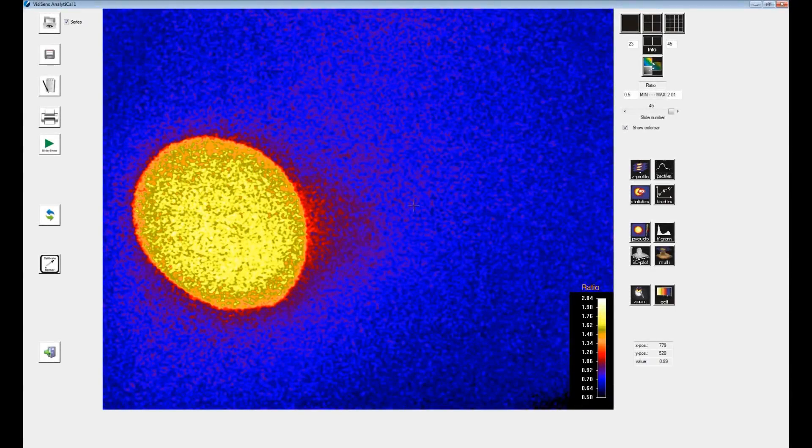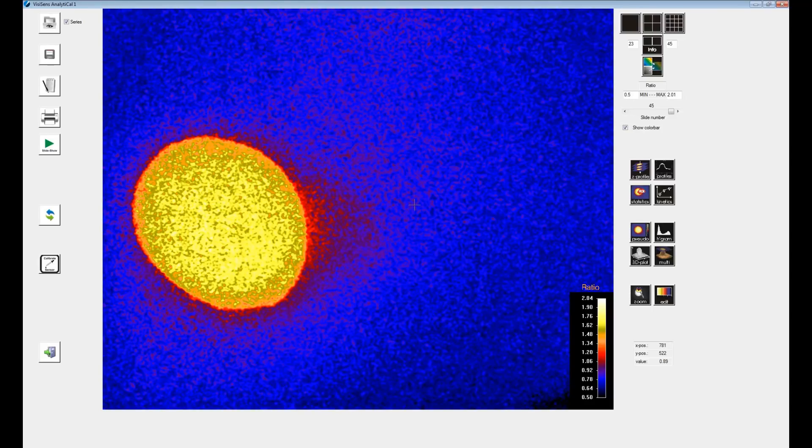Here is a short introduction on how to perform a calibration with the VisiSens AnalytiCal 1 software. To get oxygen values and percent air saturation you will have to perform a calibration.